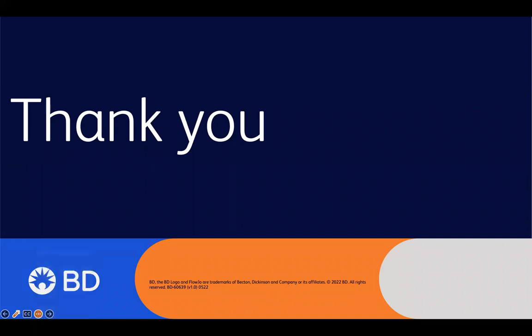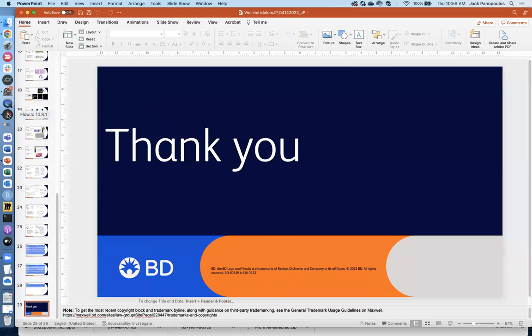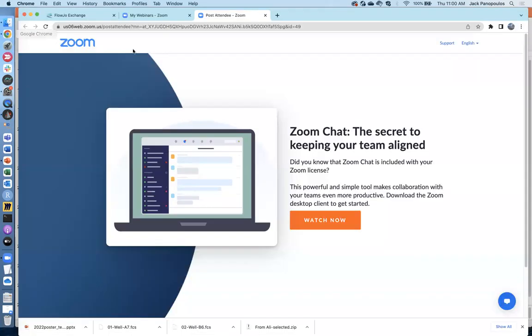And show, there we go. Okay, so let me get back to the Q&A here. Where can we find recorded webinars?